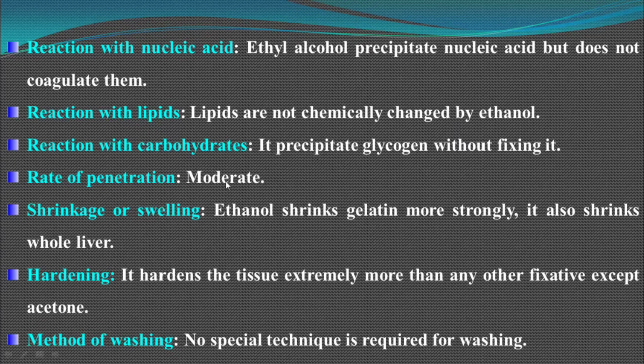The rate of penetration of ethyl alcohol is moderate. About osmotic effect, ethanol shrinks gelatin more strongly. It also shrinks whole liver.